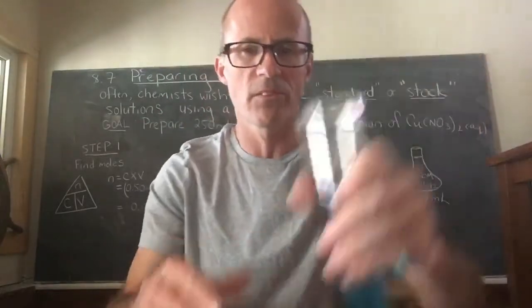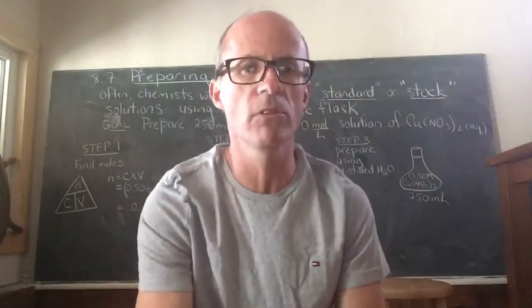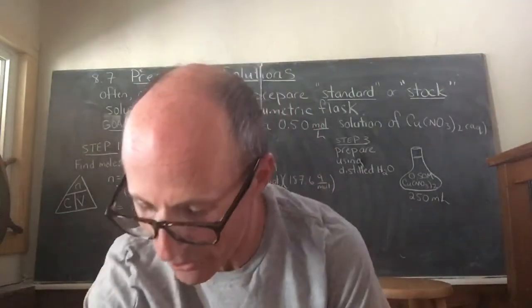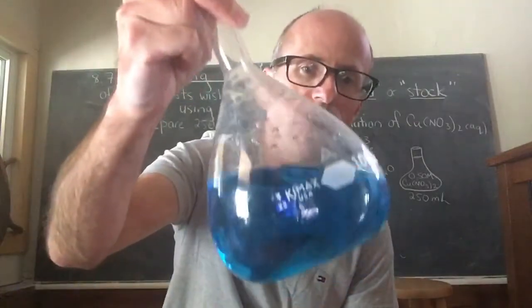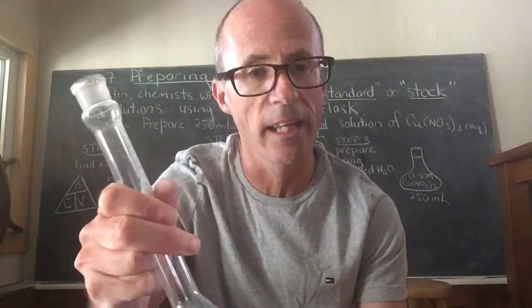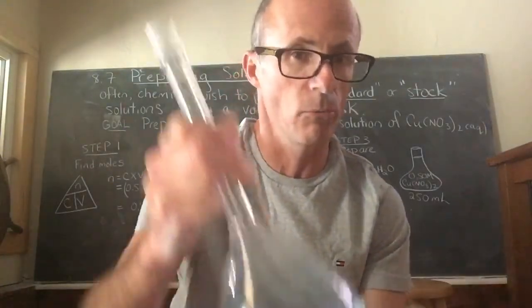Hopefully that made sense. It's a quick introduction to the preparation of solutions. Our next step will be to take our stock solution that we just made and perform some dilutions on it, and that will allow us to have a lot of use with our solution.